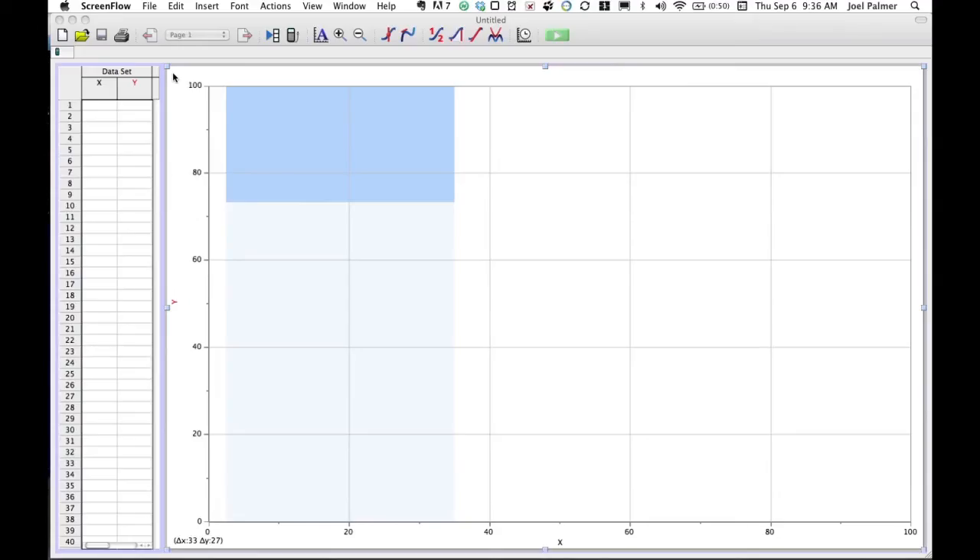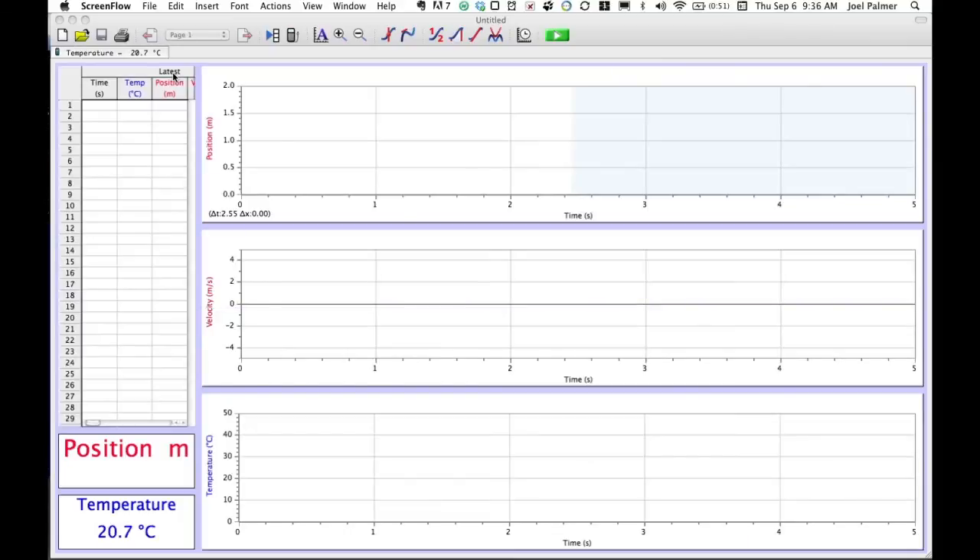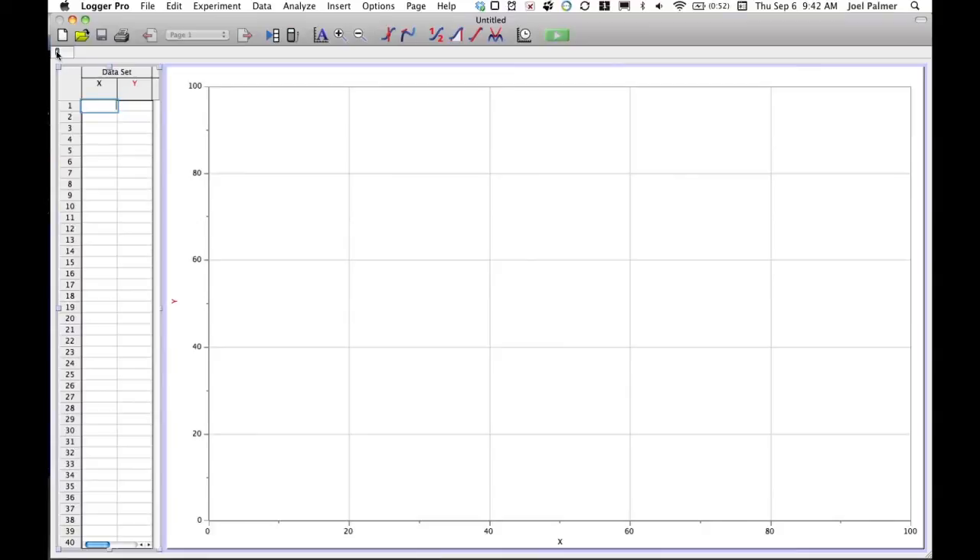Once you're running Logger Pro and you plug in any probeware, Logger Pro will recognize what probes you have and immediately change your screen, creating graphs to collect the data that probe will produce. If you plug in additional probes, the screen changes again and you can now collect data on two different probes at the same time. The Logger Pro software detects any probes you install and immediately changes the graphs to record data from that probe.